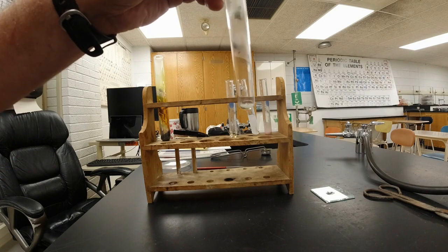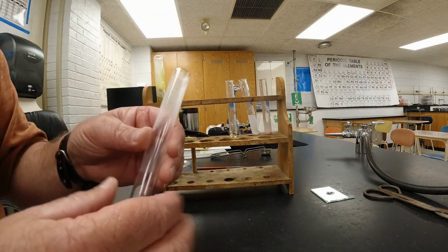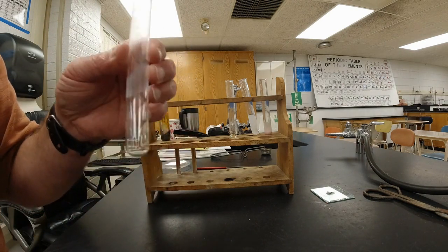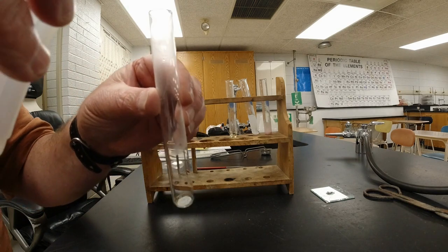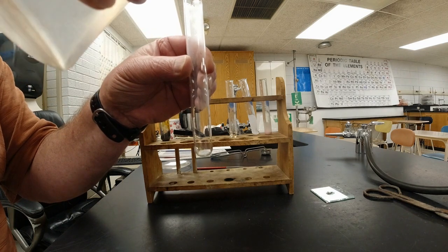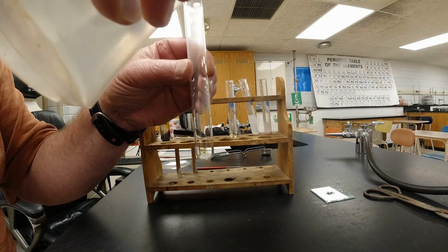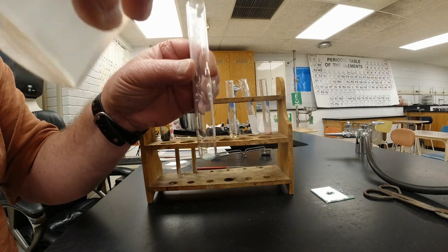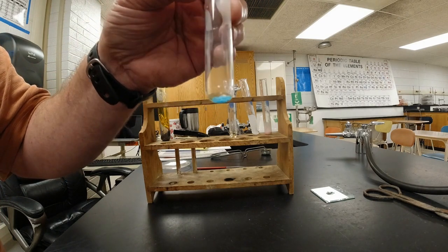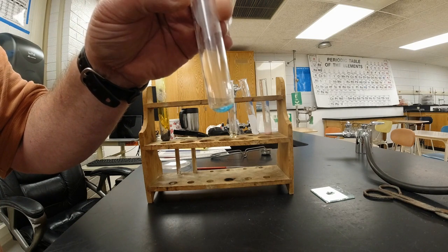Now I'm going to try to add just a little bit of water, because I see up at the top here there's a whole bunch of water vapor. Let's see if I can put just one drop of water back into this. I didn't do this when it was hot before because the test tube would probably crack. As you can see, as the water hits, the white crystals soak it up, and it goes back to looking like it did before, blue.